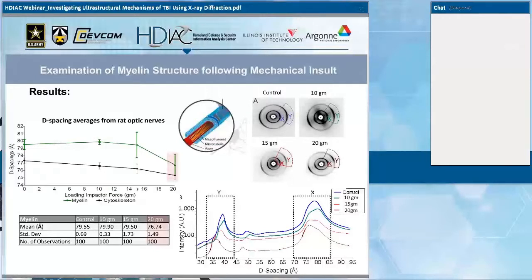And then with the black line, there's a different characterizing diffraction that is distinguished from the myelin packing layer that bears a lot of resemblance to neurofilament diffraction. It seems to be coming from along the direction of the cytoskeleton, which is along the axon length of the neuron, and that doesn't change in the same way. Obviously, there's a downward progression because we are crushing these samples, so we would expect that entirely. But the relationship is not the same as that we see for the myelin.